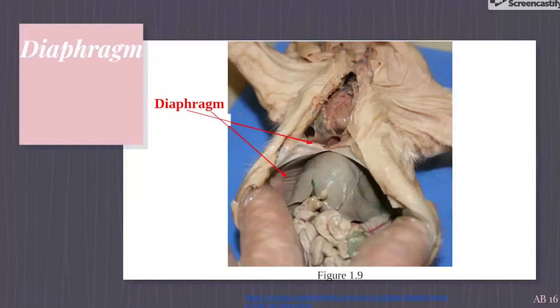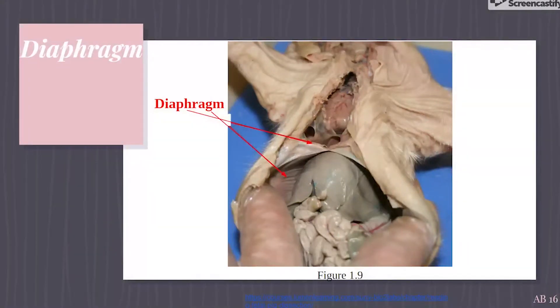Shown in Figure 1.9 is the diaphragm. This sheet of muscle is pulled back because it separates the thoracic cavity from the abdominal cavity. The diaphragm is responsible for controlling the air pressure of the lungs.